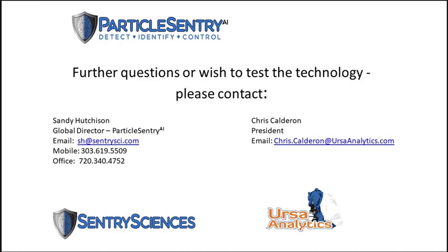That would be a bad idea in general, because eventually you'd like to do testing. And if you test on a PNG that had one type of format, then you go to a JPEG, for example, that loses some information, that's not a good idea. All right. And the second question, how are you extracting the particle images?